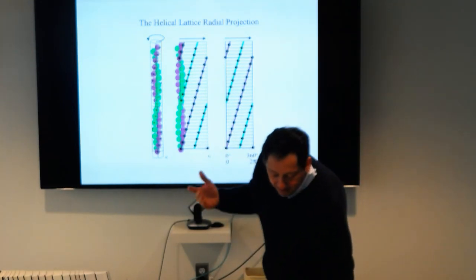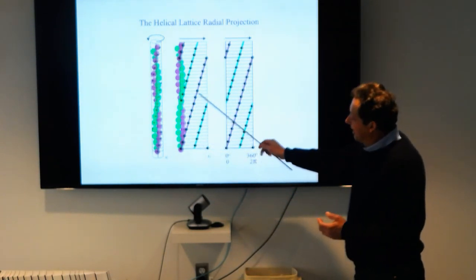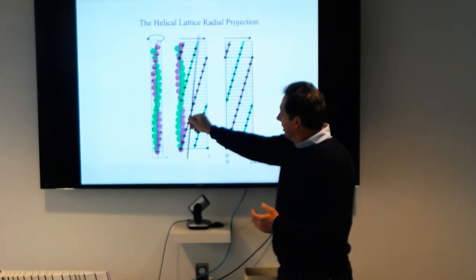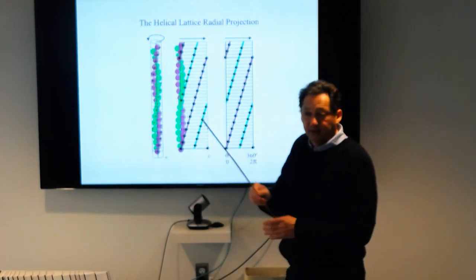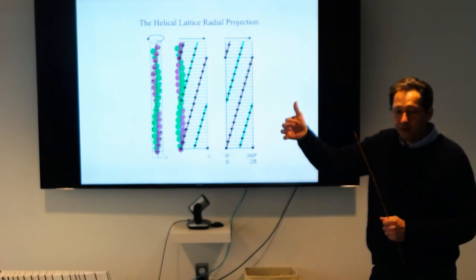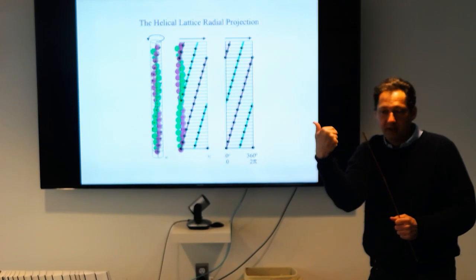And the convention is, it could be anyway, but when you have the helical path tilted clockwise, this will be a right-handed helix, and this will be a left-handed helix. Okay? And the reason why it's right-handed is you can remember your finger. When you are pointing up, you are rotating this way.